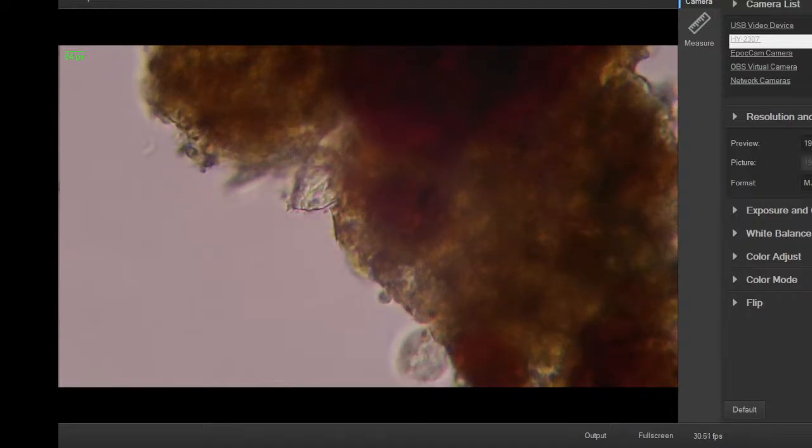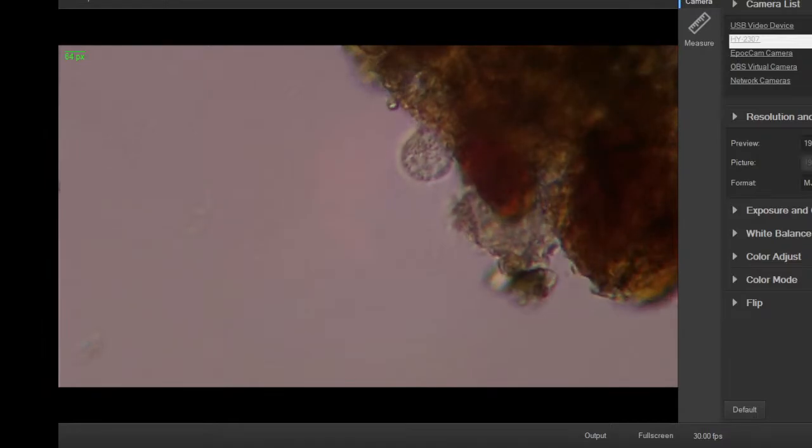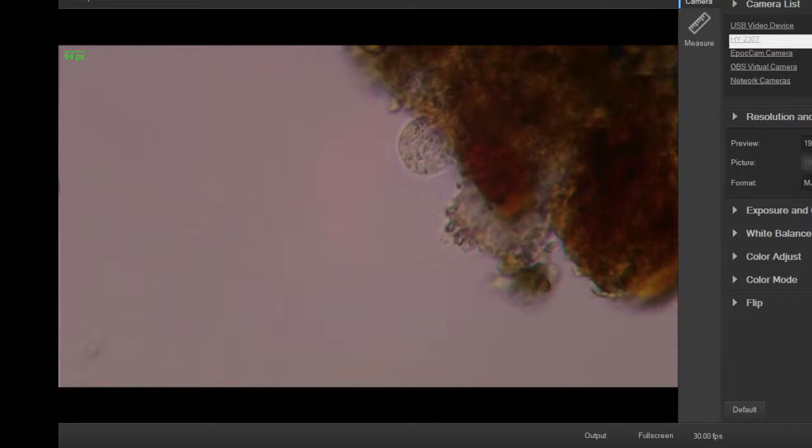I got a couple things here. That one's not doing anything. This one's just kind of oozing along. It's funny because it's really connecting with the material, just kind of sloshing about. But it's not an amoeba, it's just a ciliate.